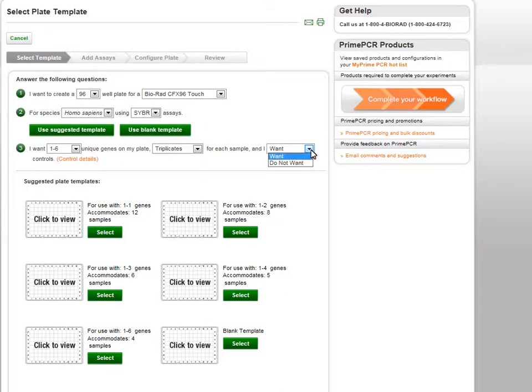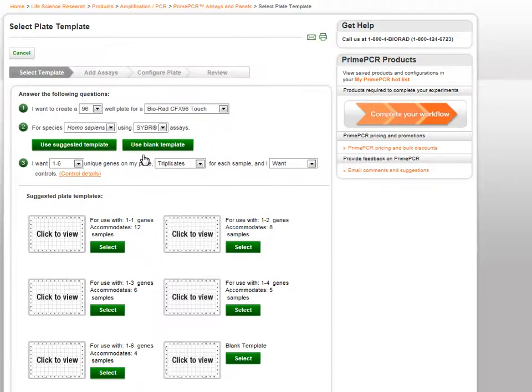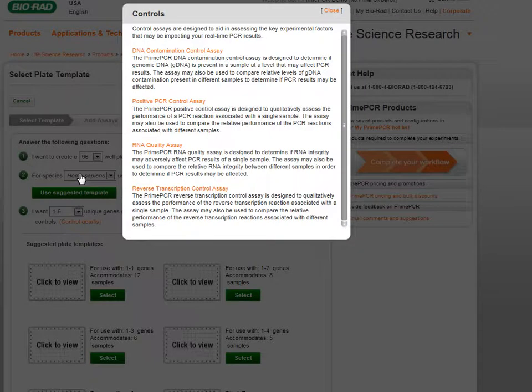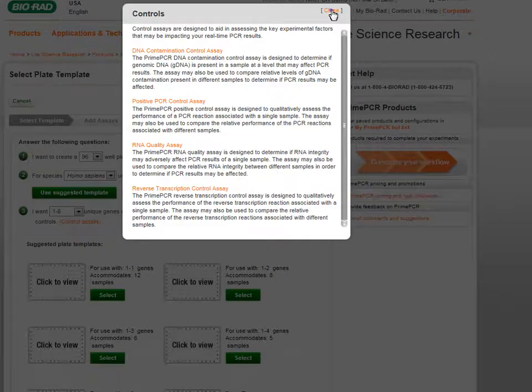Lastly, choose whether or not to include experimental control assays on your plate. If you would like detailed information about the control assays, you can click on the Control Details link in parentheses for a summary and link to each of the control assays.